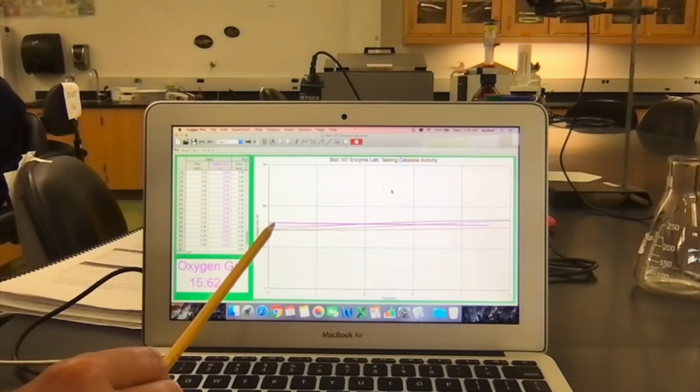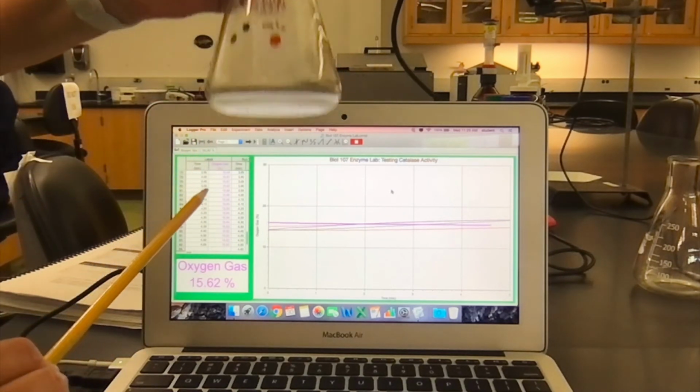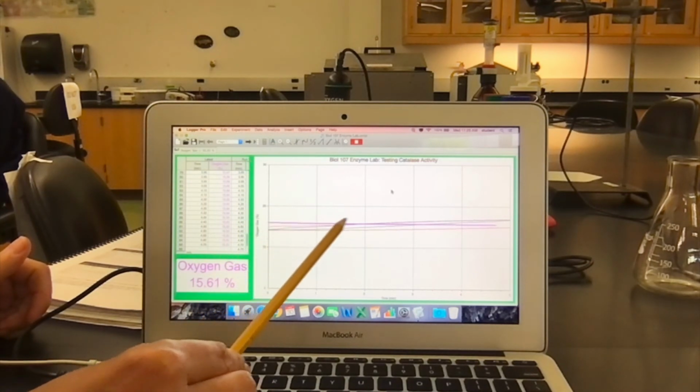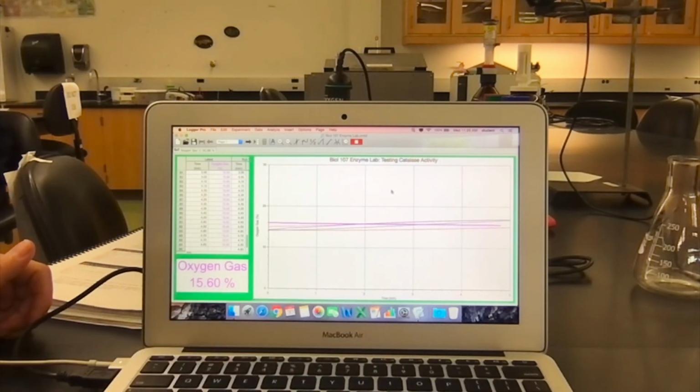Okay, so this is my extra run I added, the purple one. This was with putting the buffer in boiling hot water and then seeing what happened to the enzyme. And you can see that the purple line either goes straight across or is heading on down.